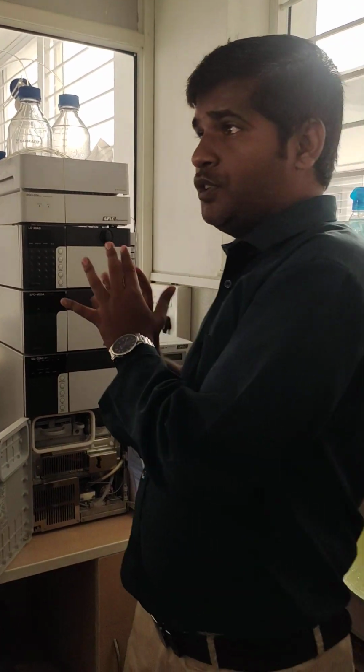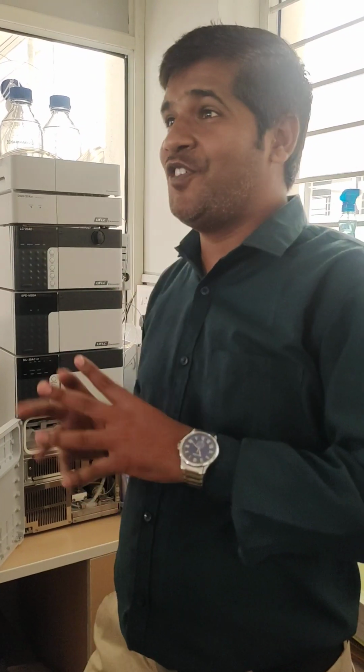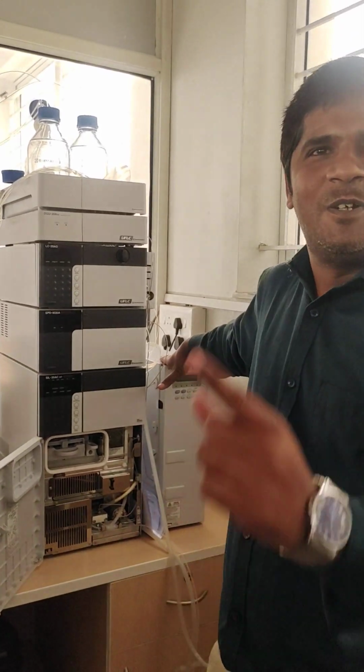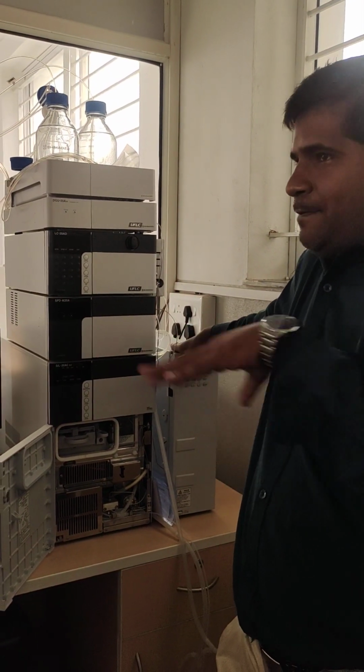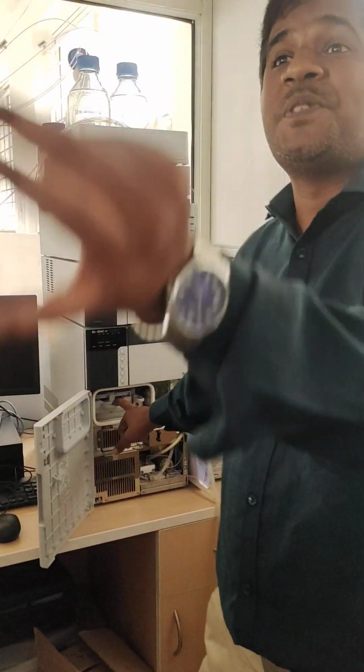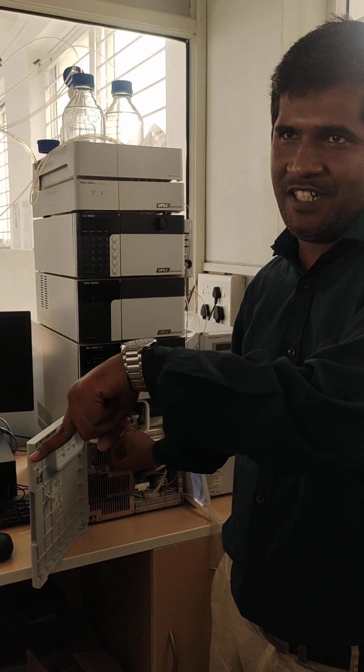Suppose we want to check the effect of a drug in the West Indies also. In the West Indies the temperature is more than 45 degrees centigrade. And if you want to check the effect of the drug in Switzerland also, in Switzerland the temperature is minus 5 degrees centigrade. Such types of conditions we can maintain in the HPLC. Means column oven to maintain the temperature of the column as per our requirement, and sample cooler to maintain the temperature of the sample at 0 degrees centigrade.